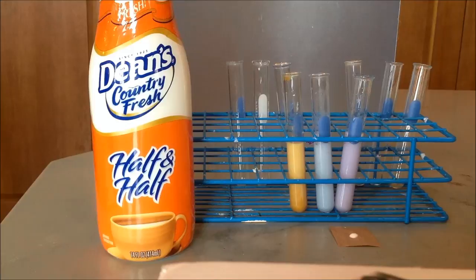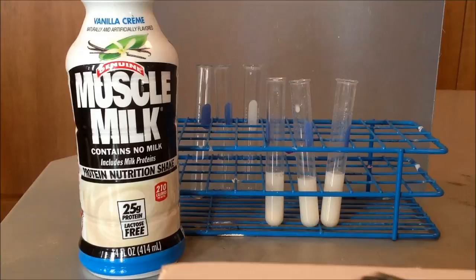This is the protein shake test, so you can make your initial observations of the protein shake. Here are the test results for the protein shake. The first one is Lugol's iodine, Benedict's is second, then biuret is third, and then there is the lipid test.